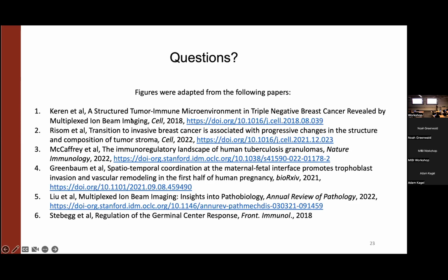The analysis pipeline. Yeah, and this kind of gets to almost like a philosophical question, because one of the things that we've debated back and forth is that it makes sense to look at random permutations, in most cases with cells, because cells are known to be capable of being at different places in the tissue, right? But then, most of the time we treat larger objects, like a blood vessel or something like that, as being a stationary feature, right? So things can come to it, but it doesn't really go to things, right? And so it may be that it would make sense to treat the ECM the same way, which is that it gets deposited, it can be broken down, but it's not mobile.